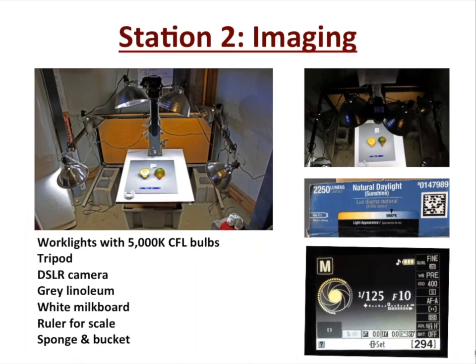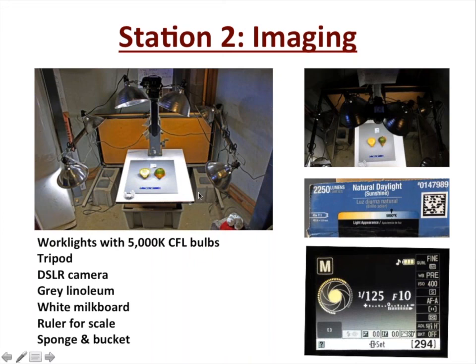The next step is imaging. You can see our photo setup here. It's pretty easy to set up: some shop lights with CFL bulbs, cinder blocks and a table to clamp everything to, and the camera on an old photo enlarger table. You can also get clamps that will clamp right onto a table, a two-by-four, or a tripod. We have six work lights positioned around to minimize glare. The plastic we normally have curved around this area also helps reflect light in to remove shadows. The key thing is we use 5,000 Kelvin CFL bulbs — that refers to their color temperature, which is right around the same as a camera flash, giving a pure white light that makes it easy to take good pictures.